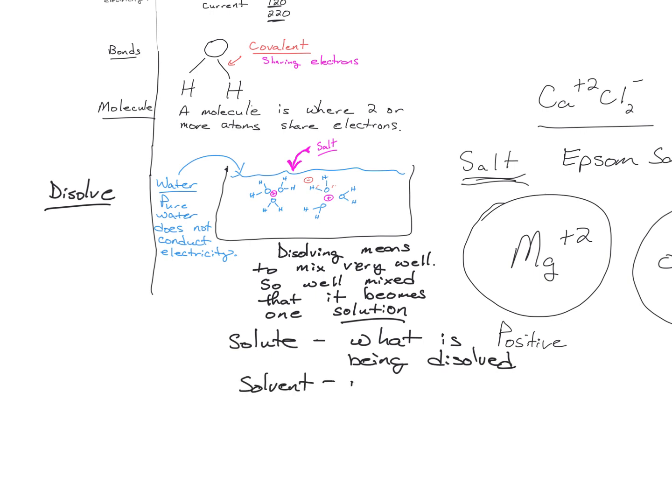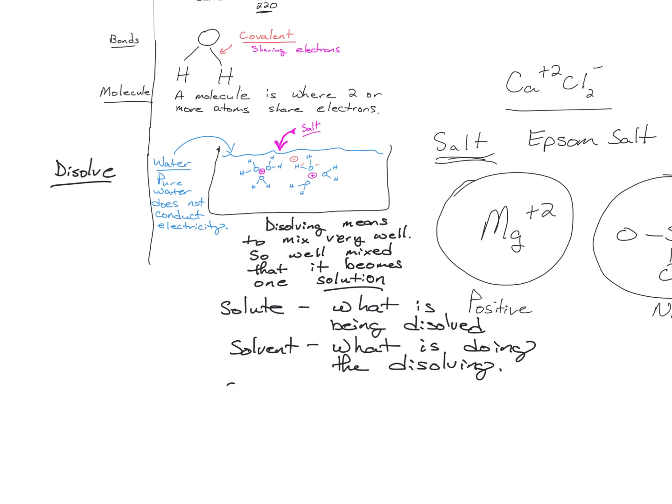That is what is dissolving, what is doing the dissolving. And there is a solution. That is the result, the mixture itself. This is the mixture.